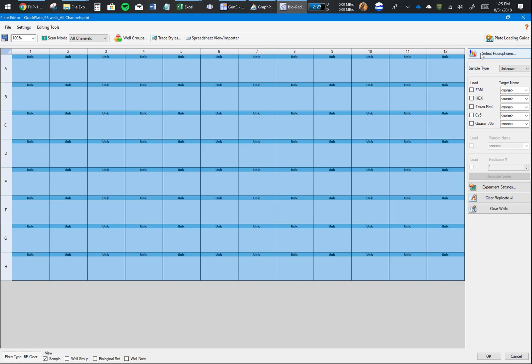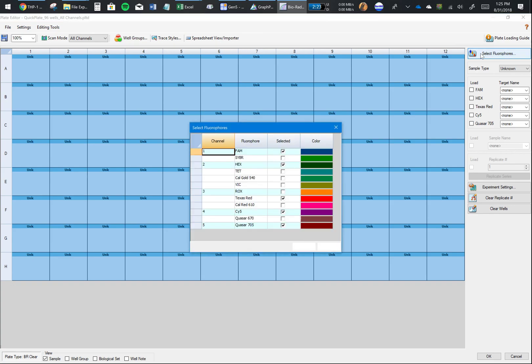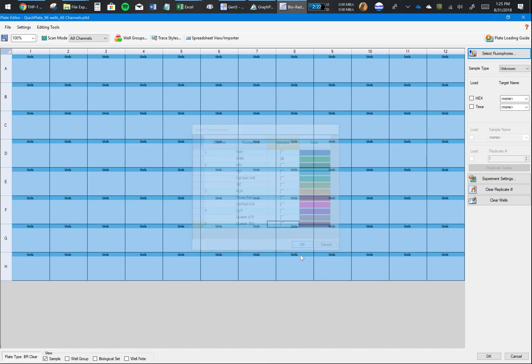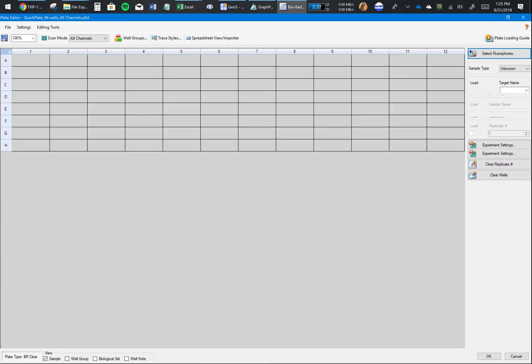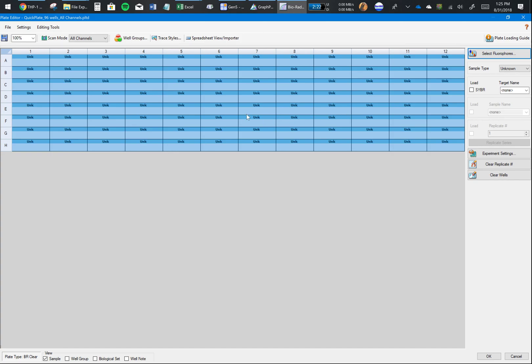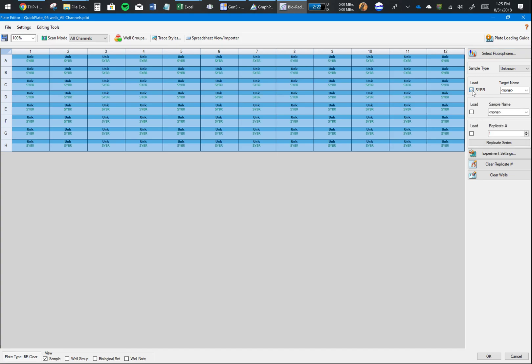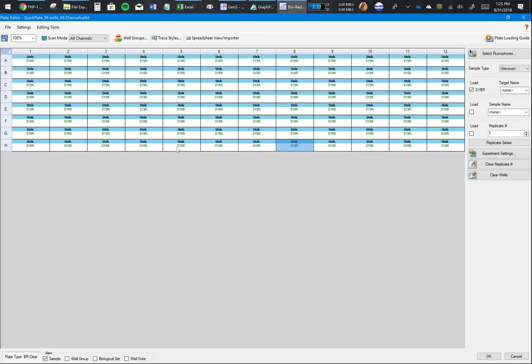Next, you want to tell the software which dyes you're using. If you have the qPCR instrument connected to this computer, which you will, you will not see all these fluorophores. The instrument we're using is the CFX Connect 96, and it only supports one fluorophore, which is SYBR Green.